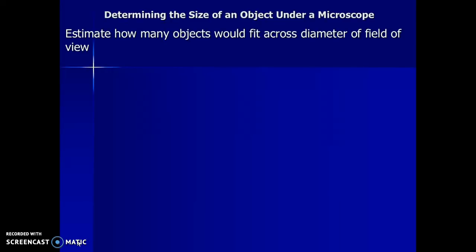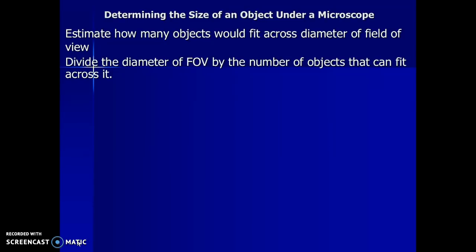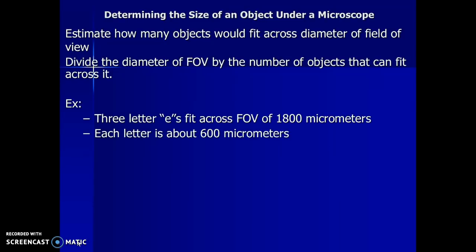Determining the size of an object under a microscope. So now you will use some practice problems, and a few things that I have given you, you will view them under your microscope to actually understand the functioning of the microscope.